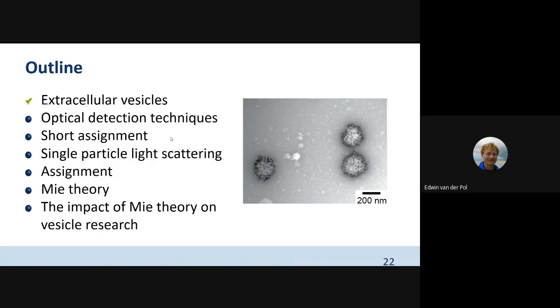All right. Now I think the field of extracellular vesicles is perhaps 15 years old when it really started to grow, although some old papers are already from the 70s. But I started just 11 years ago in this and was one of the first physicists. And the question which my supervisor then asked is, Edwin, I don't know, we are interested in vesicles, but we don't know how to detect them. Your PhD is about figuring out the best way how we can detect them.